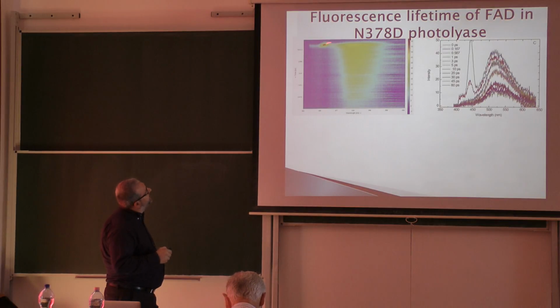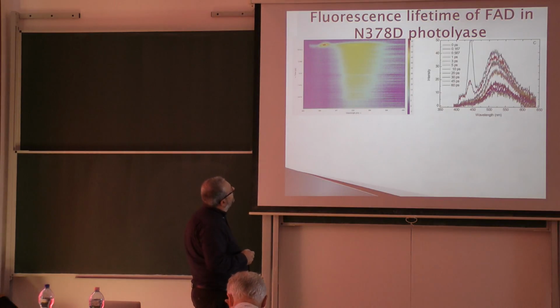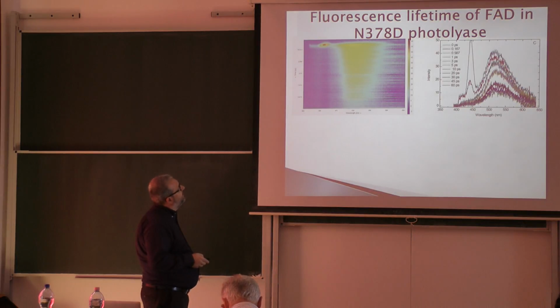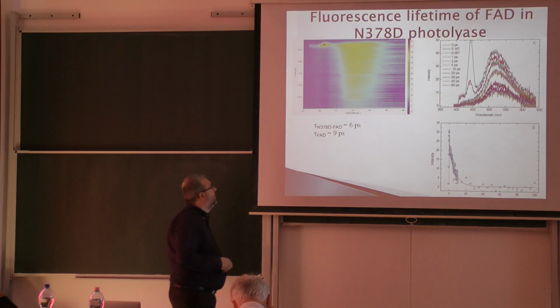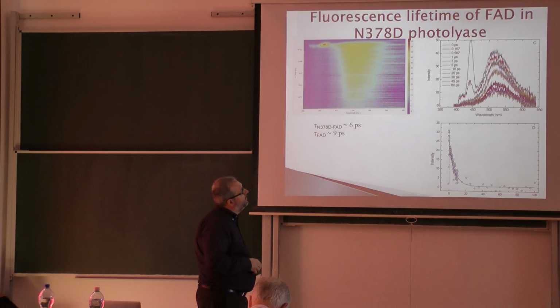Now what you can see here is simply the Raman scattering of the solvent we are using here, which is very nice actually. You can see even that one. So now, if we measure the fluorescence lifetime at, let's say, 520, we have a very fast decay, close to 6 picoseconds, and as I mentioned, in the free form of the flavin, that was 9 picoseconds in water.